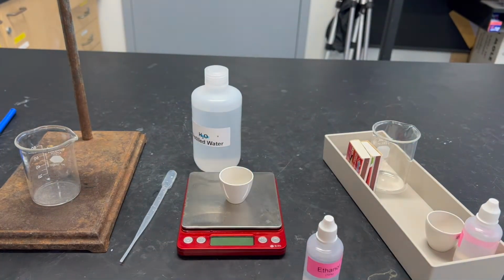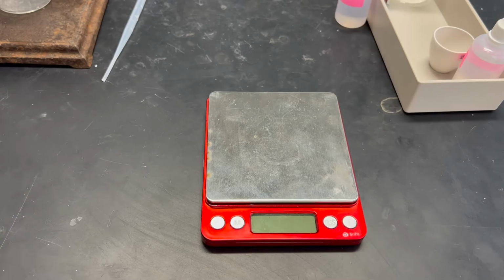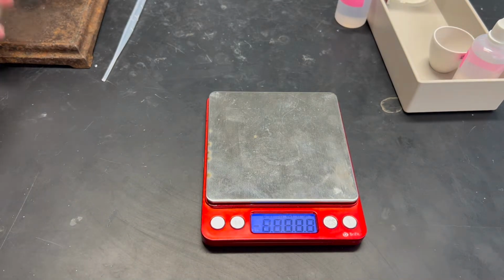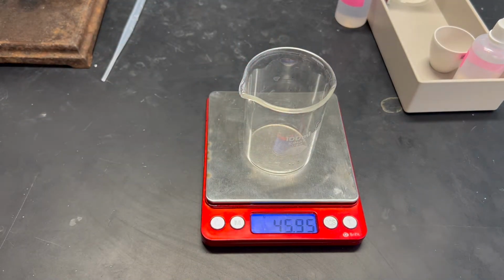Some of these things will be in a shared tray on your desk. This is meant for 2 groups. First thing we're going to do is measure out 20 grams of water. Turn your scale on. Wait for it to turn on. Put your beaker on and click the tare button.